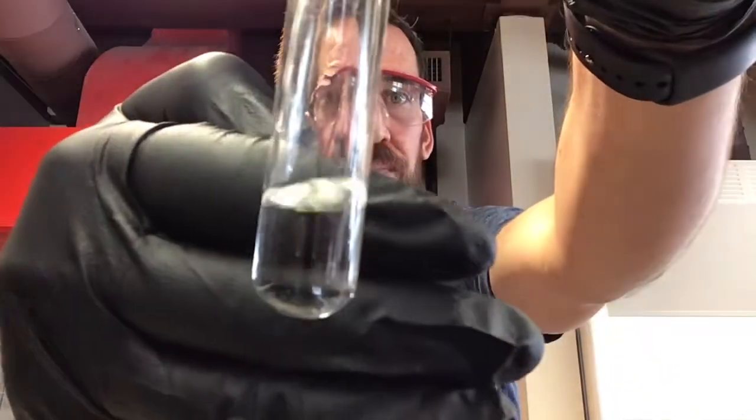So we just need to make sure that when we're doing these reactions, we make the best observations and notes as possible. What I want you to do throughout this video is write down anything and everything that you see, whether it's a color change. If it's a color change, I might mention that to you because it might be a little bit difficult to identify or observe it in the video. And if there's a precipitate or cloudiness or whatever, I'm going to hold up the test tube like that so that it's visible to you, and so you can make your observations.